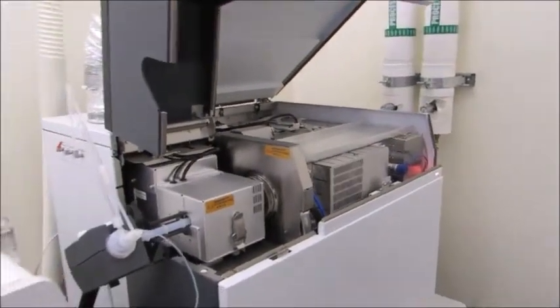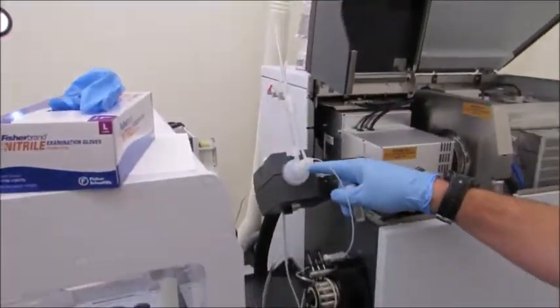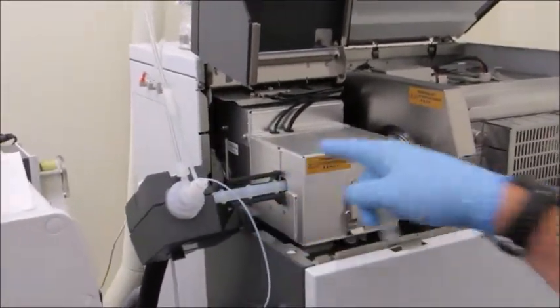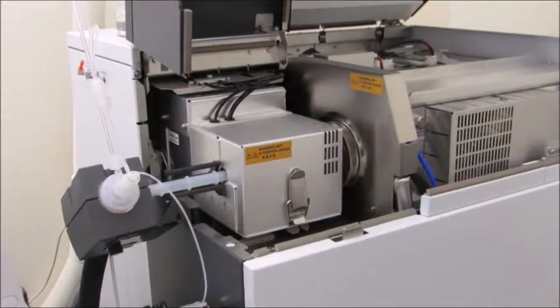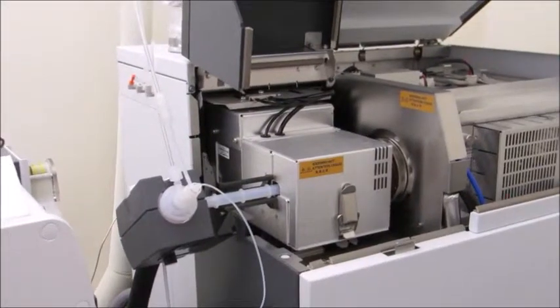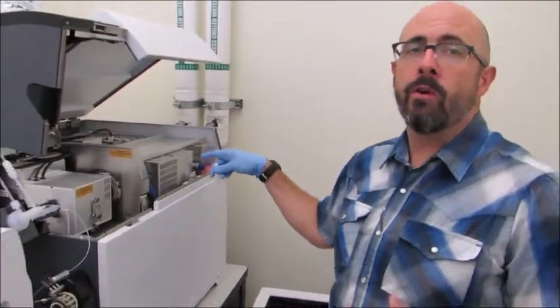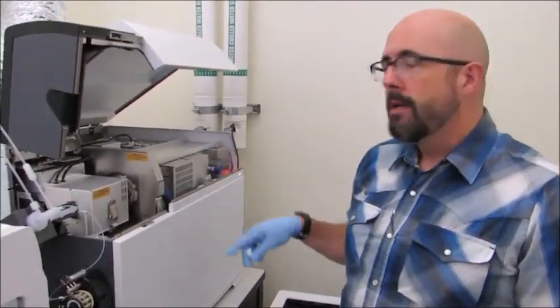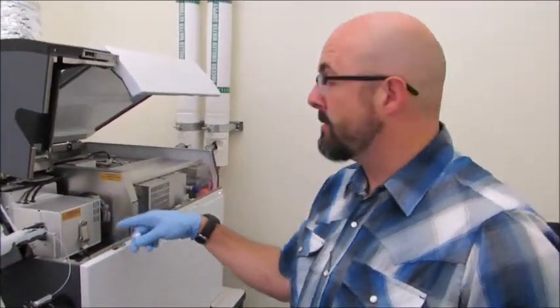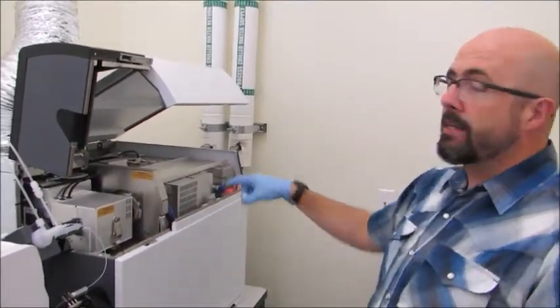But instead of measuring a gas, it sucks up the liquid in this tube. It enters this chamber where it's mixed with a stream of argon gas, so it forms a mist. That mist is shot through this tube into this box where it goes through an RF generator, which turns it into a plasma. Of course, what that means is that it ionizes all of the atoms. And once atoms are ionized, we can manipulate them using either a magnet or an electrical field into a mass spectrometer. So that's why they call it an inductively coupled plasma. It's an induction coil that creates the plasma. The plasma contains argon gas and then whatever is in your sample, and it's shot into this mass spectrometer.